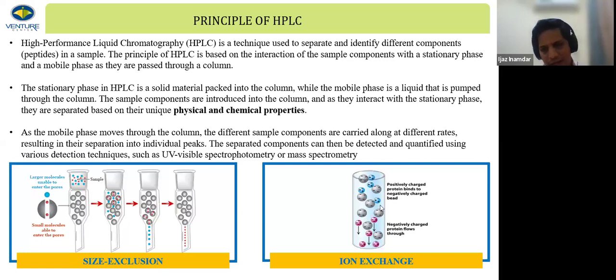One more example would be ion exchange. If your molecule is highly charged, or there is a difference in charge density, or some molecules are positively charged or negatively charged, you can take advantage of ion exchange.